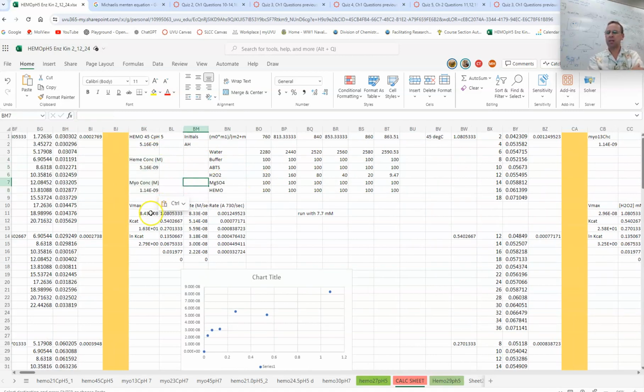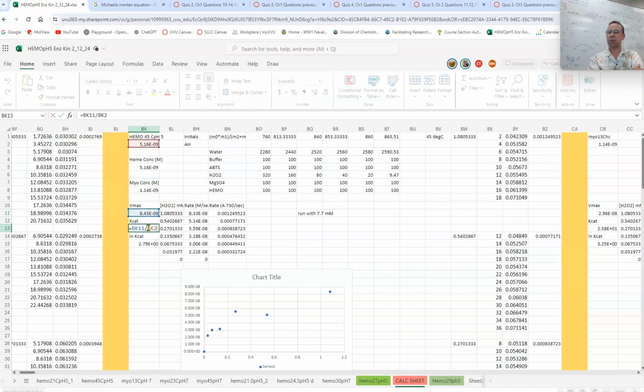The Vmax, this sheet converts or identifies the KCAT from the Vmax. Okay? And the way it does that is it takes the Vmax, like this equation says, and divides it by the enzyme's molar concentration. If you ever make a mistake like that, you can always push escape and just get out, or you can push undo after you do something.